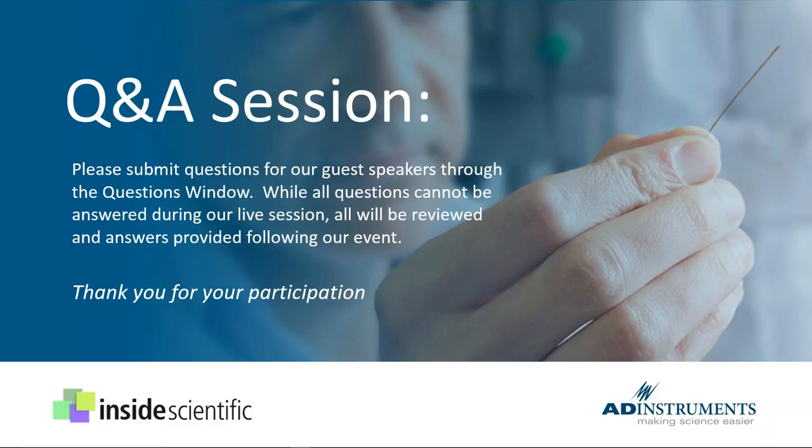Let's talk about if someone's goal is to determine small differences between mice in cardiac function, and stroke volume is an important measure for them, what would you recommend as far as a calibration approach, which is going to best serve them when they're looking at small differences in mice? And again, stroke volume is a key parameter that they want to report.